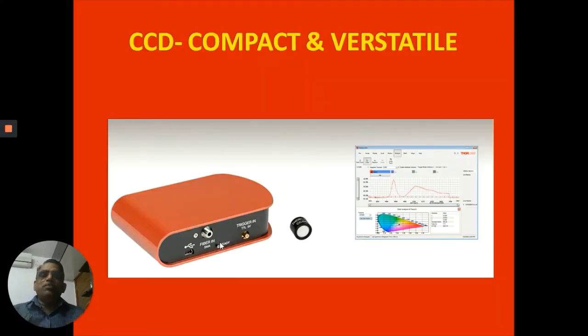CCDs are really becoming compact, and they are versatile. They can do XY measurements. You can also make 3D plots, like what we have seen in the excitation, emission measurements. So CCDs can also give you 3D plots. That is possible.